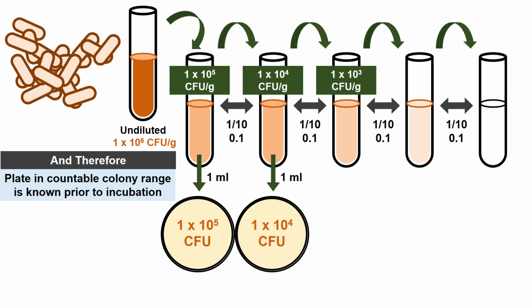You may remember its concentration is 1 times 10 to the 3rd CFU per gram, aka CFU per mil, and that is 1,000th of the original tube, 10 times less than the 10 to the 2nd dilution tube. This is the 10 to the 3rd dilution. I hope you're getting the language now here. And again, we're going to do this in class as well. So we'll all get to have hands-on interaction.